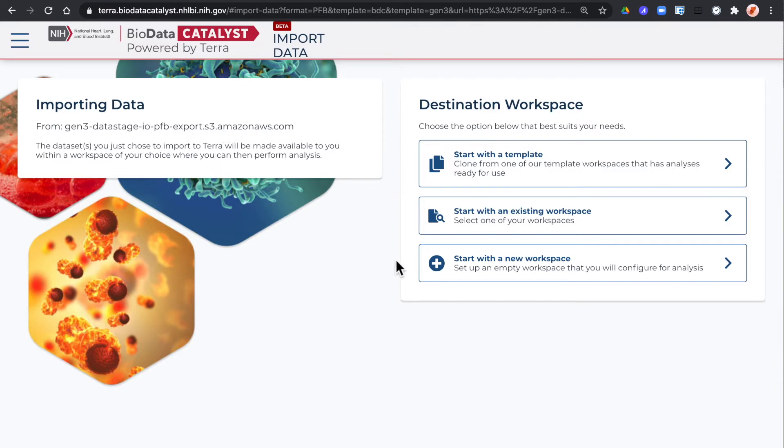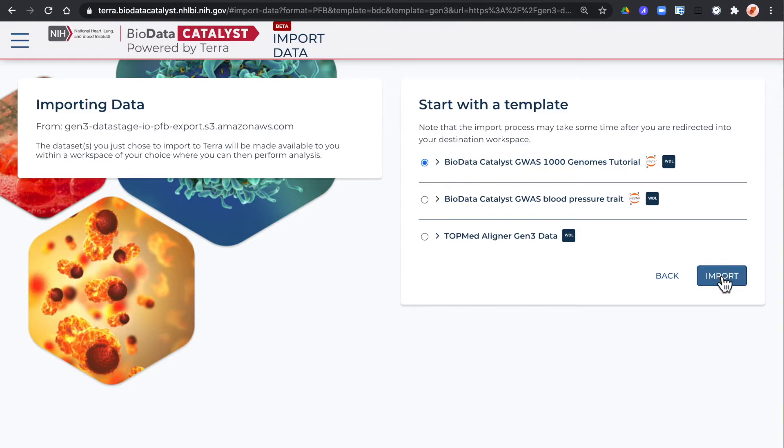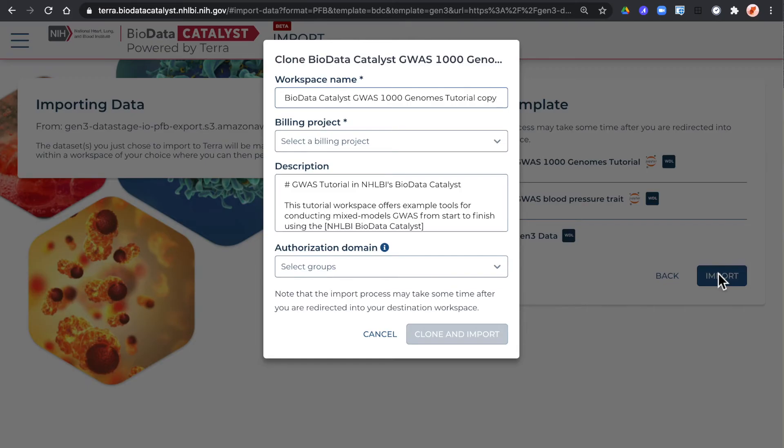You can start with a new workspace, an existing workspace, or a template. Click on the blue import button.